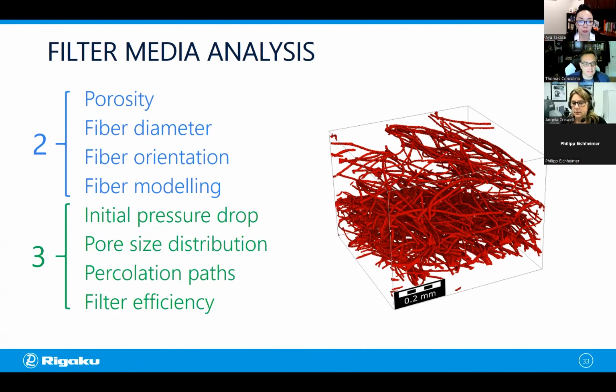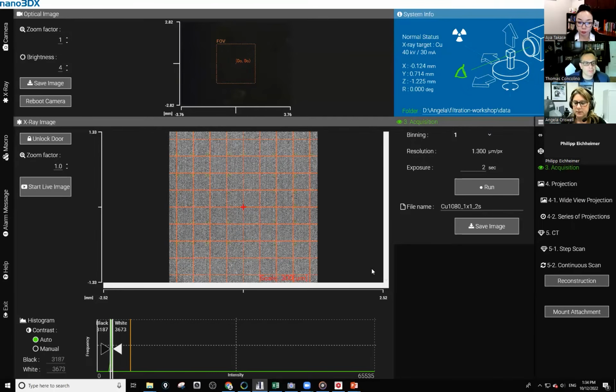All right. Then we've got a couple of questions related to your last couple of slides. You had mentioned how you pick peaks with the different voxels. Is there a threshold or a best practice for saying that your binning is too large?